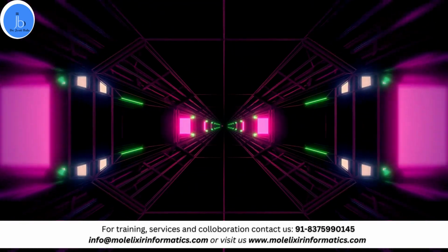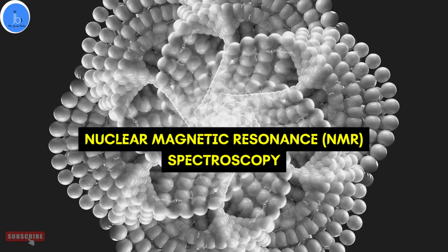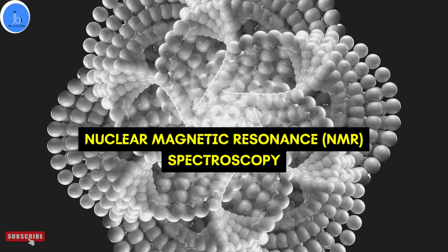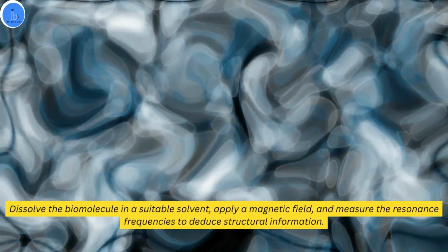The next one is NMR spectroscopy. This is nuclear magnetic resonance spectroscopy. This analyzes the structure, dynamics, and the interaction of biomolecules in solution. Usually, this involves dissolving the biomolecule in a suitable solvent, applying a magnetic field, and measuring the resonance frequency to study the structural information.